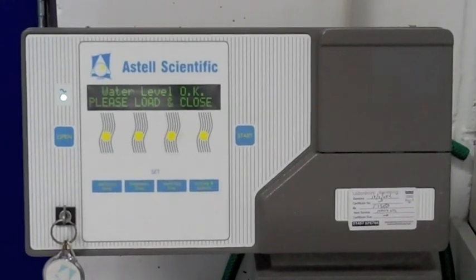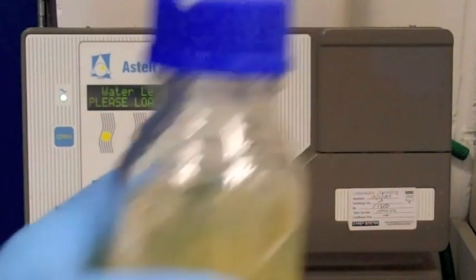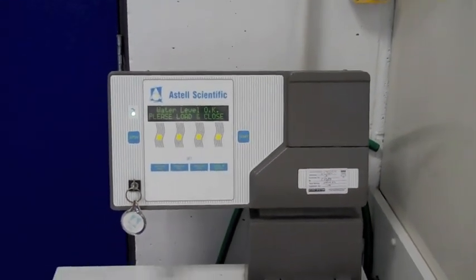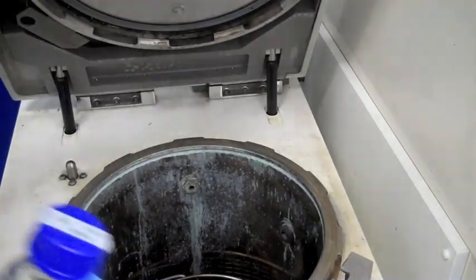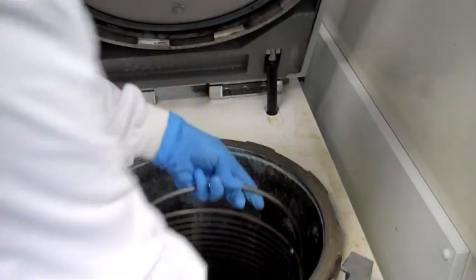So we'll now put in our media into the autoclave and set it going. So we have our bottle of LB Agar that we created. So simply lift the lid of the autoclave. So here it is. Lift the lid. And there will be a basket inside. Place your media into the basket. Make sure the lid is not totally tight, just slightly loose there. Place it into the basket.